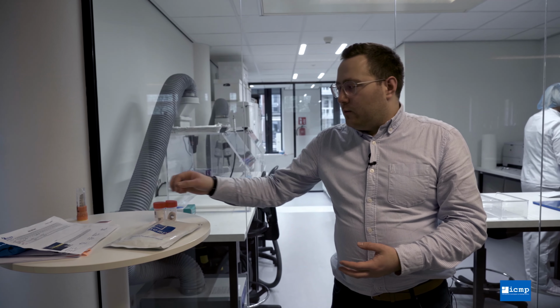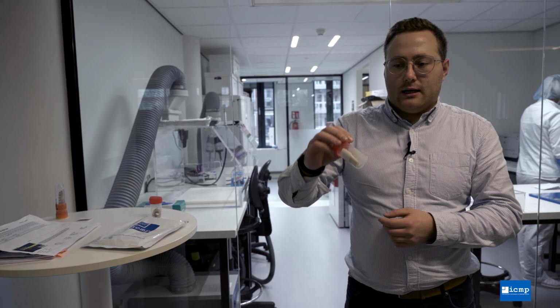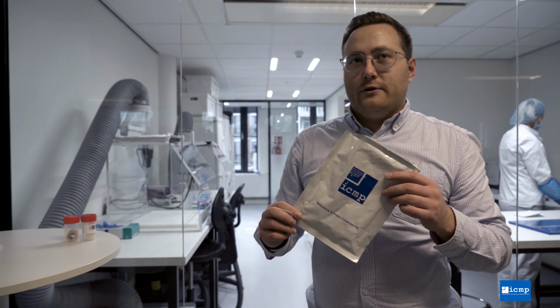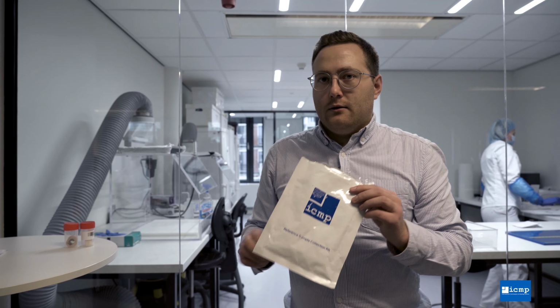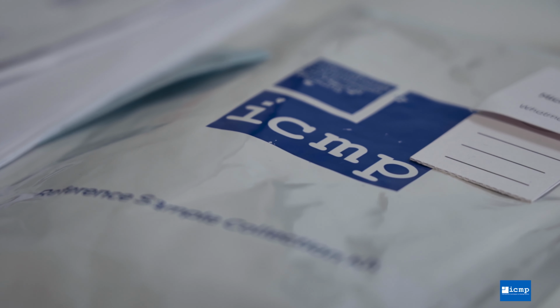The ICMP DNA Laboratory receives two main types of samples. We receive skeletal remains, such as a bone fragment that looks like this, and family reference samples that are collected using a reference sample collection kit such as this. These reference samples are collected from family members and stored on a card in such a format. Let me take you on a tour around our laboratory and I'll explain how we process these two types of samples.